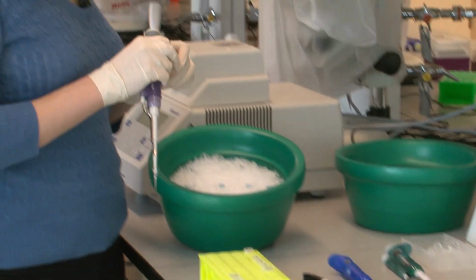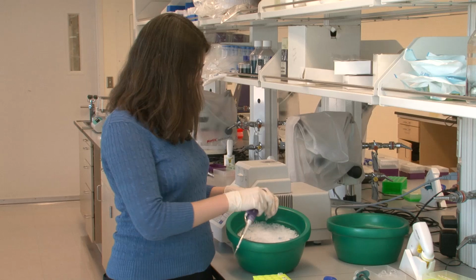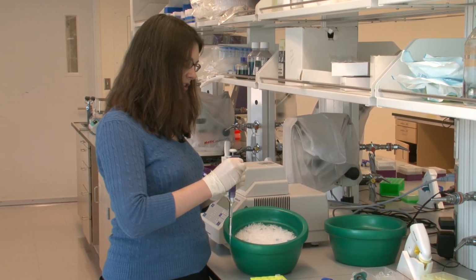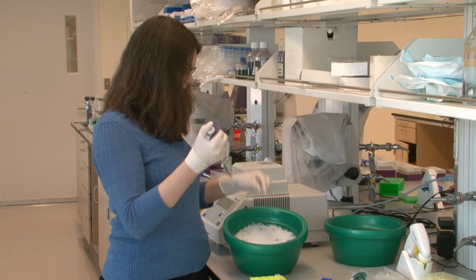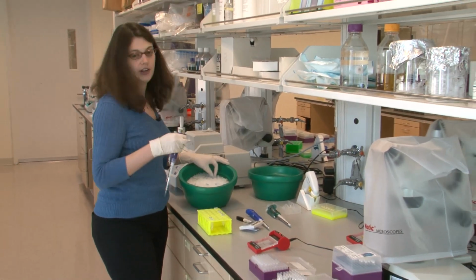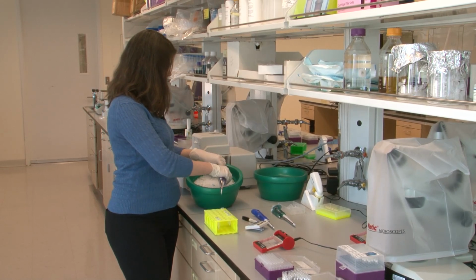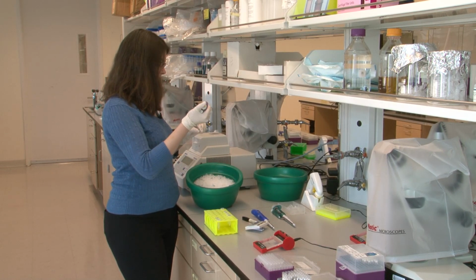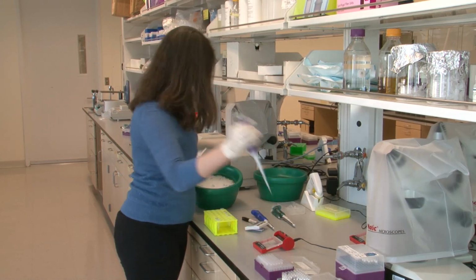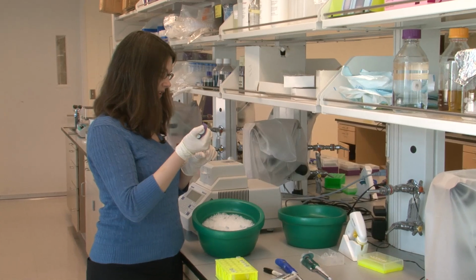The next thing I'm going to do is add the reagents or chemicals that I'll be needing for each copying reaction to each one of the tubes. This includes all of the necessary chemicals that take you from having a small amount of DNA to copying it into a large amount of DNA. Each time I pipette a different sample, I use a different pipette tip so that none of the samples are contaminated with each other.